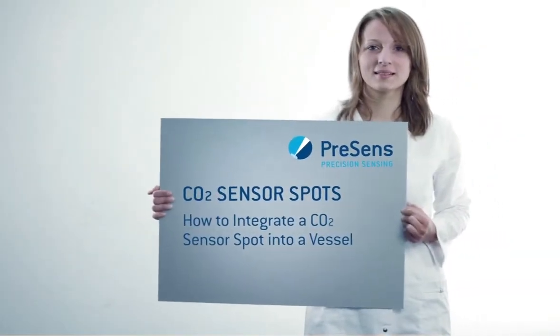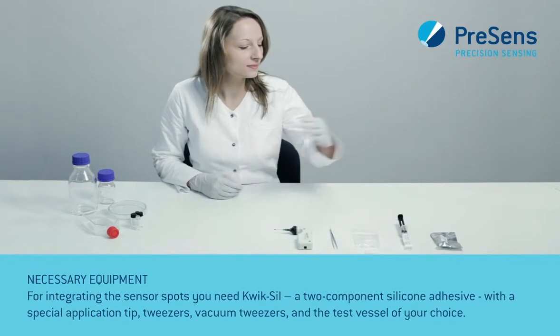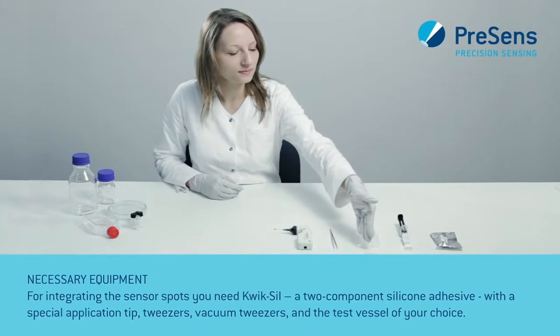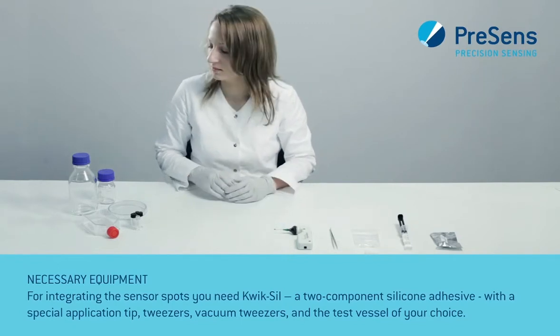Now we will show you how to integrate a CO2 sensor spot into a vessel. For integrating the sensor spots you need Quicksil, a two-component silicone adhesive with a special application tip, tweezers, vacuum tweezers, and the test vessel of your choice.